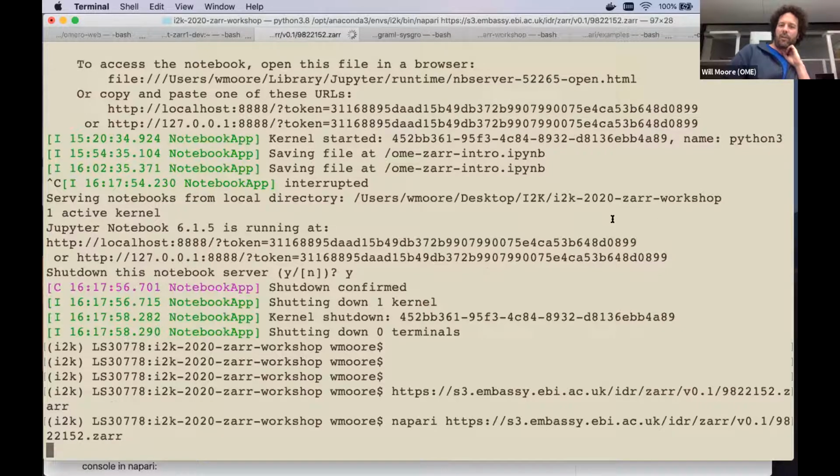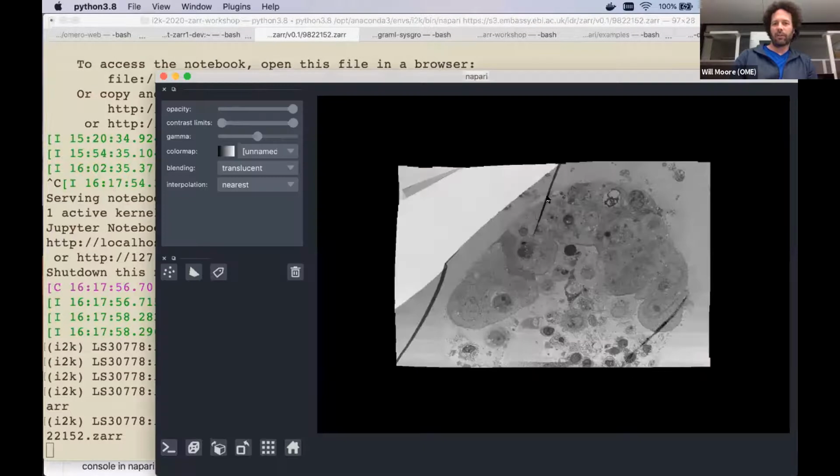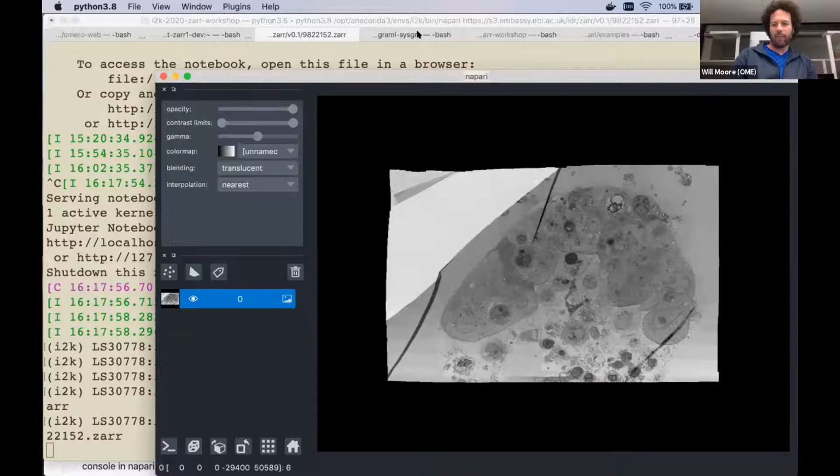Okay. So this is again doing the same things we did in the Python example before. It's creating a pyramid, a list of Dask arrays. In passing that list of Dask arrays to Napari, we're not loading any data up front, but Napari is then able to request the pixel data that it needs from that virtual stack, and those tiles will be loaded as needed.